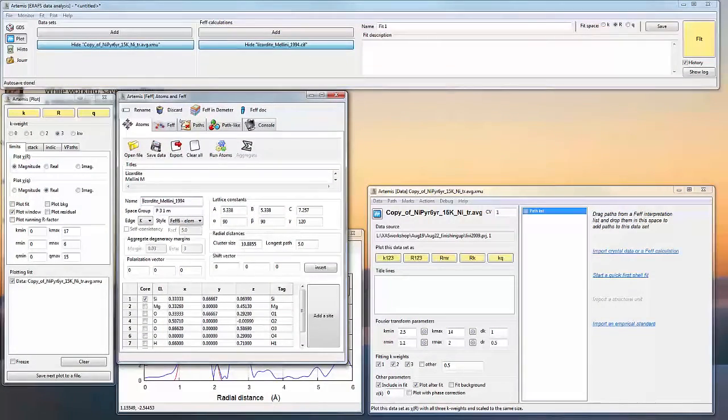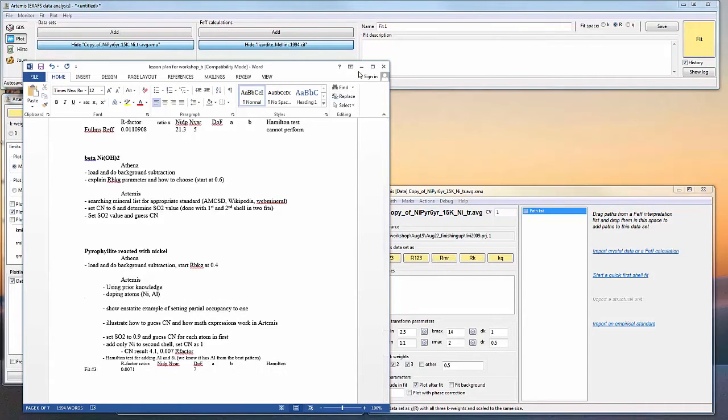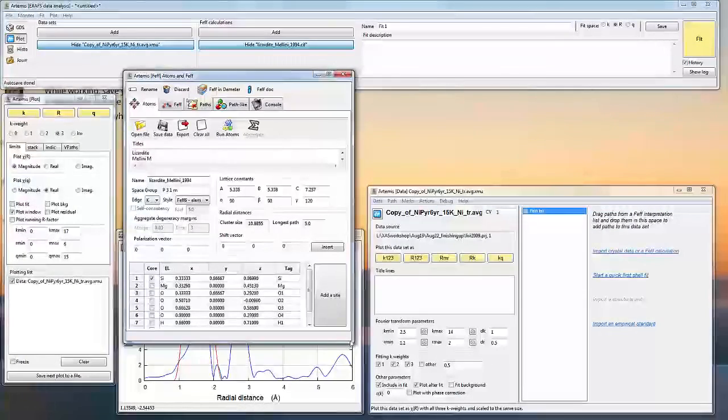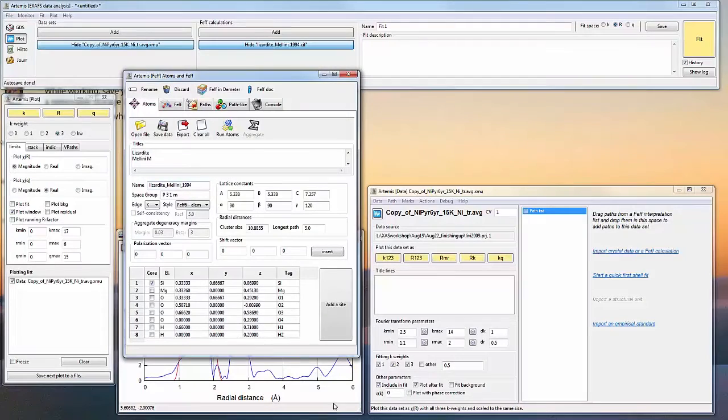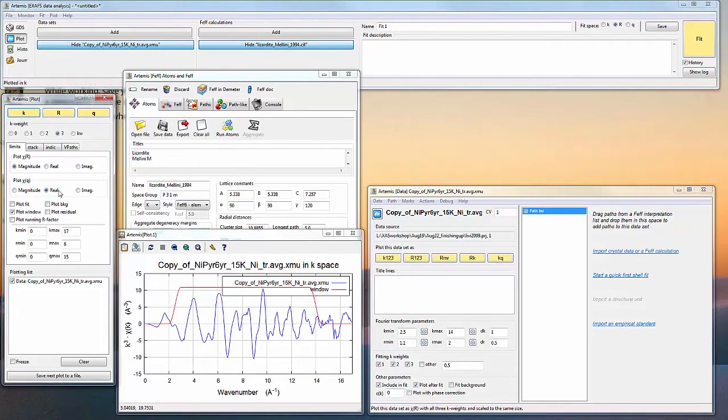And this is where I want to show some examples of doping and how to substitute atoms in and out. So I already know basically what this sample is based on several distinctive features in the EXAFS oscillation.